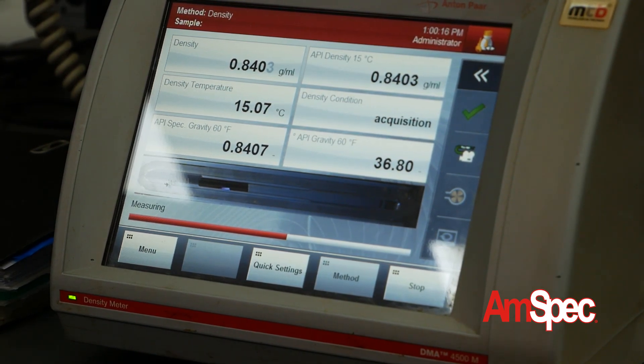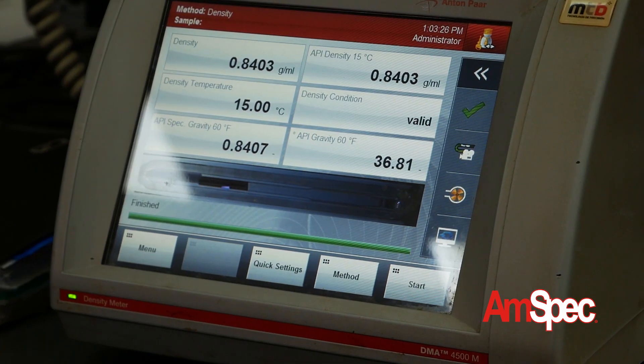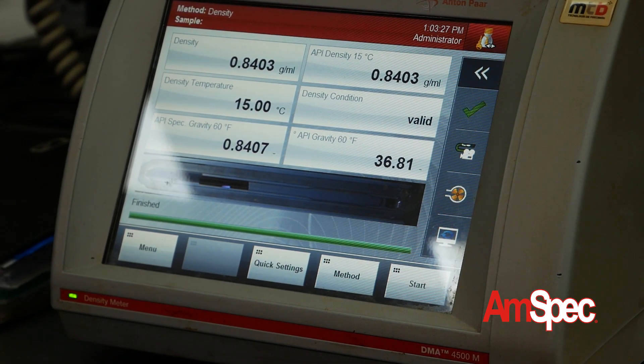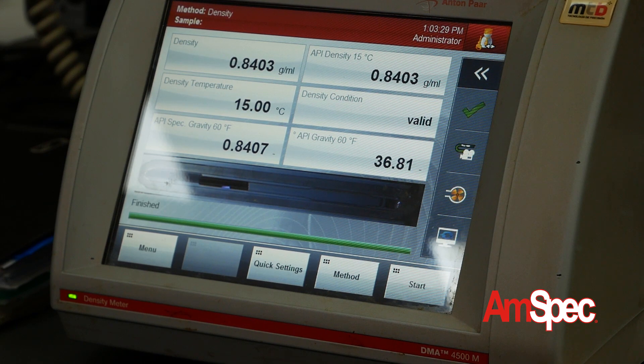When the analysis is finished, the result appears on the screen of the instrument. The test is performed twice and the average of the two results is reported as the final analysis result.